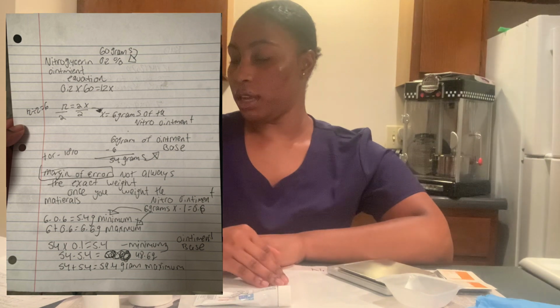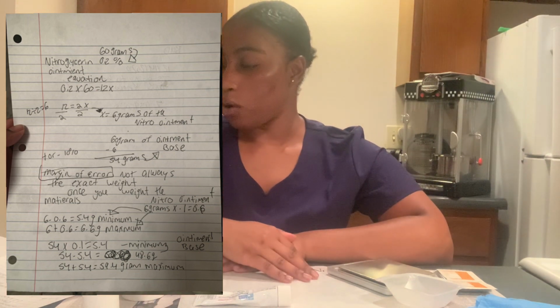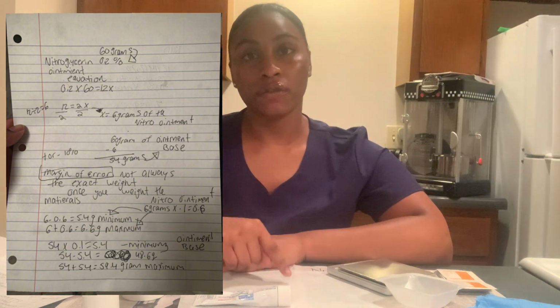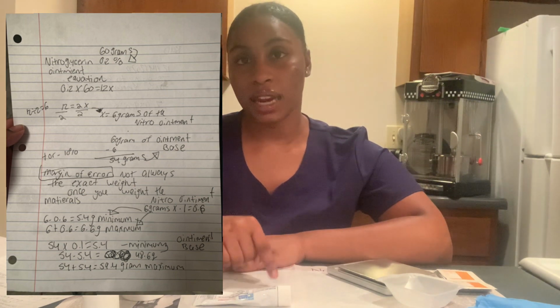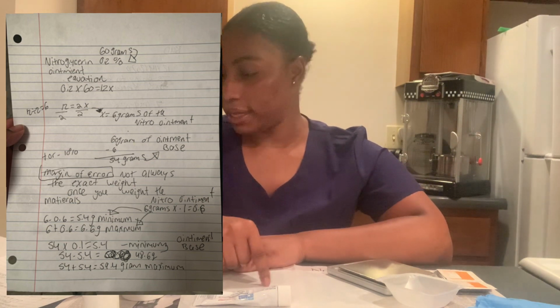With the ointment base, we are going to subtract the 6 grams that we just calculated, which will give us 54 grams. So we'll be weighing 6 grams of the nitroglycerin ointment and then 54 grams of the ointment base.